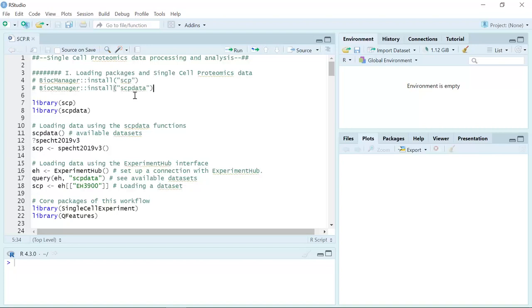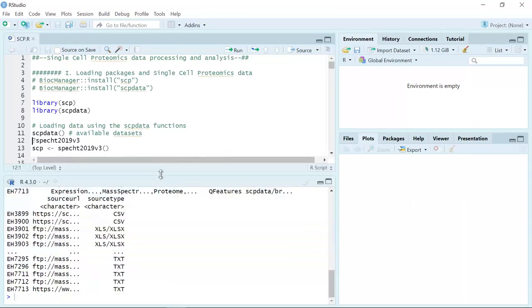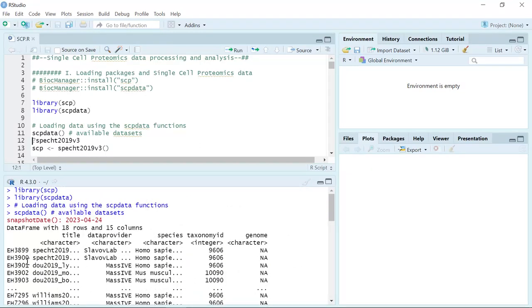I installed SCP and SCPdata already, so let's just load the packages — SCP, then SCPdata. Because we loaded the SCPdata already, let's see how many data sets are in it. You can see we have 18 rows, so that means we have 18 data sets in SCPdata. Each data set has 15 columns to show the data information. We can use the first and second column information to load the data. The second column contains the title of the data. For EH3899, this is the SPECHT 2019 data set; EH3900 is the v3 version.